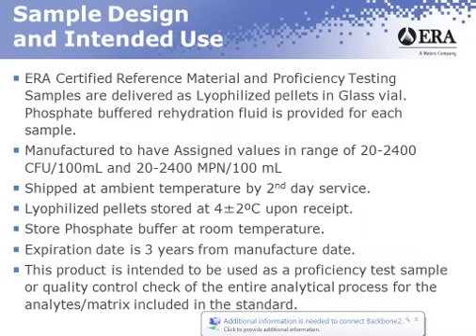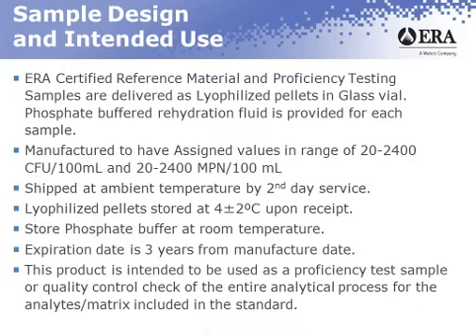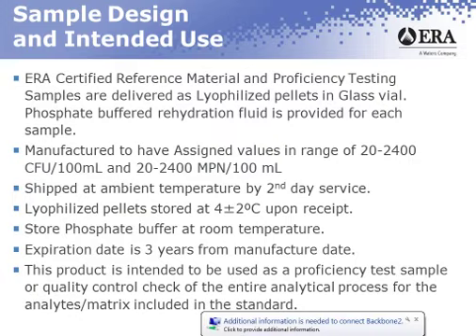Anything shy of true lyophilization opens you up to the possibility of the organisms actually going through some changes that you want to avoid, definitely for a QC and a PT sample.